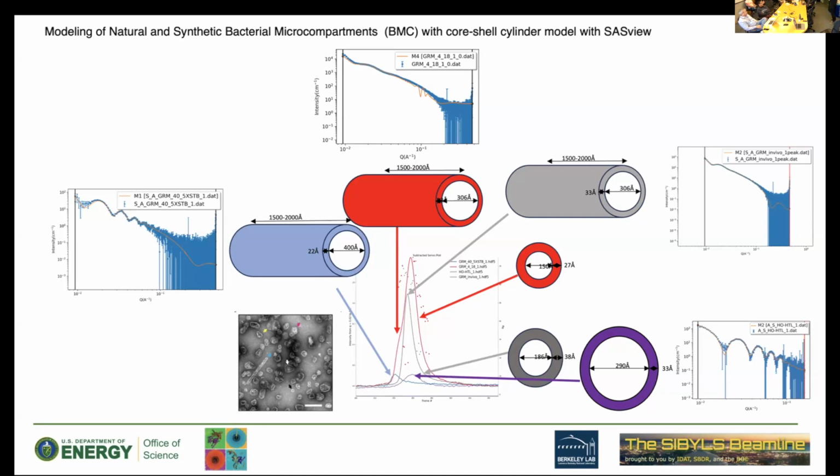It's a protein. I mean, it's a peptide. Oh, that's problematic. Not problematic for the Fox. Fox can take anything. Any atoms can be taken in the Fox. Heavy atoms, peptoids, strange amino acids. But peptoids, I'm not sure if you can predict some kind of structure.